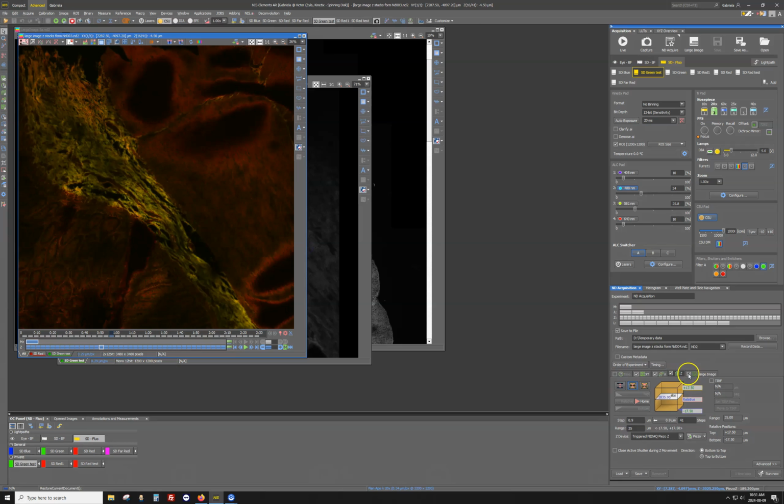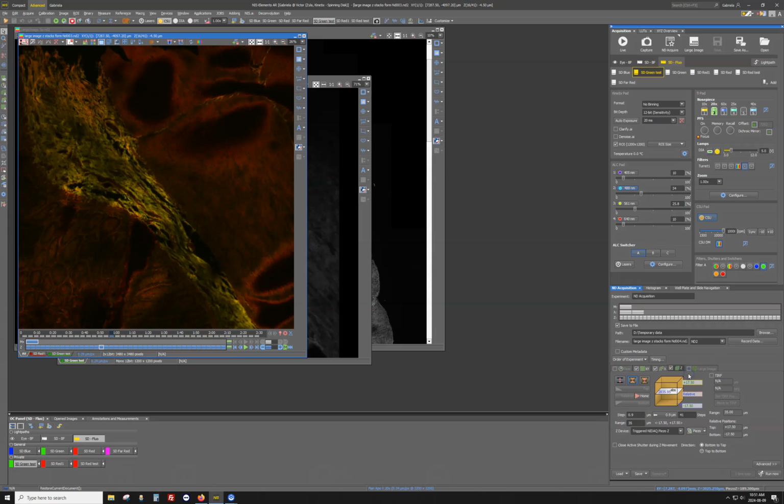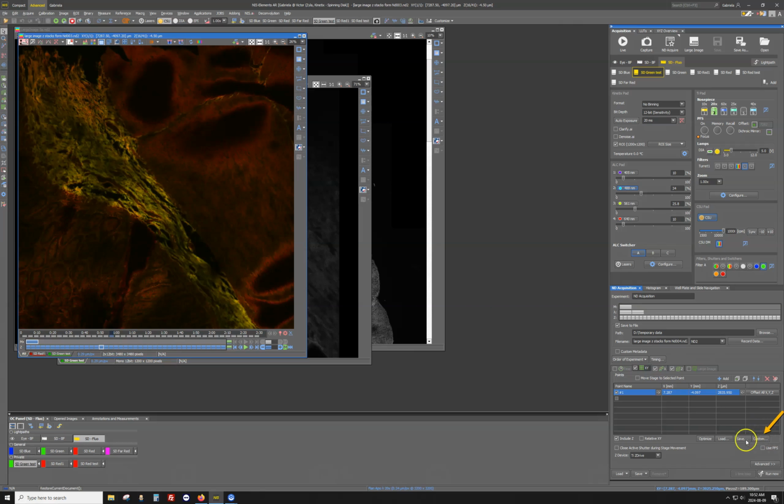First, we will tick off the large image tab, then the acquisition. We will keep the position for the time being where we are, so we know around which position we want to create the tiled image. We'll keep the same number of Z, and we will also have the same 2 optical configurations. But now we'll use this custom button, which is found in the XY tab in ND Acquisition.